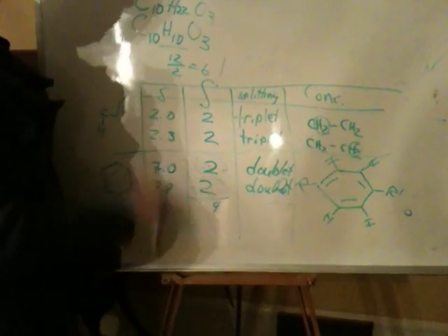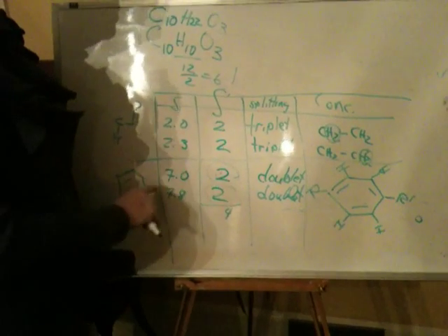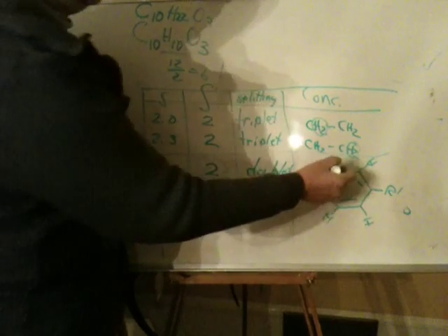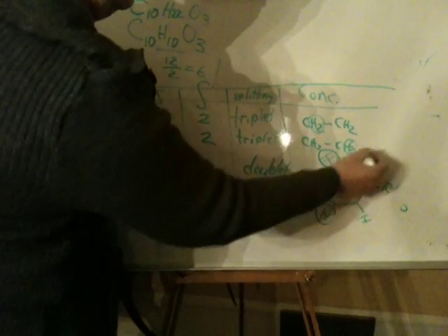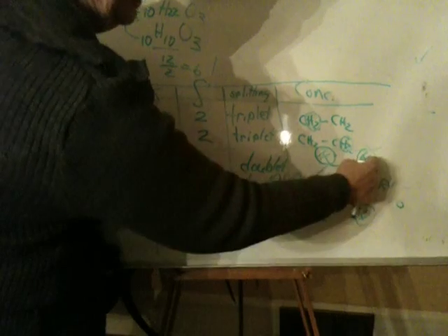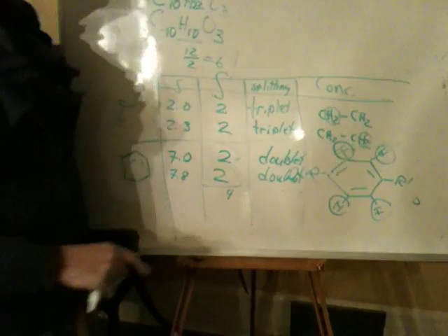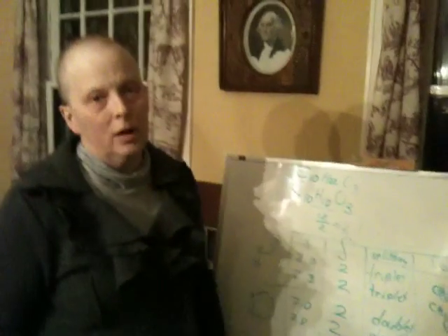However, that doesn't work when you're dealing with double bonds or unsaturation. So these 2 are the same by symmetry across the ring. So these 2 are the same, and these 2 are the same. But each one in that pair is talking to one, so that's why you have the doublet. And what I suggest doing is looking at all the other combinations that would give you 4 hydrogens.